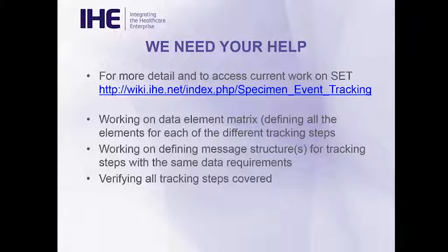We would love to have your assistance on this. If you have a software product involved in management of specimens, I believe this profile can be very useful. There's a data element matrix that's currently being defined and message structures that are being detailed. And we're trying to ensure that there are not tracking steps that we have missed. So I encourage you to reach out to that link and participate in this IHE process. Next slide.